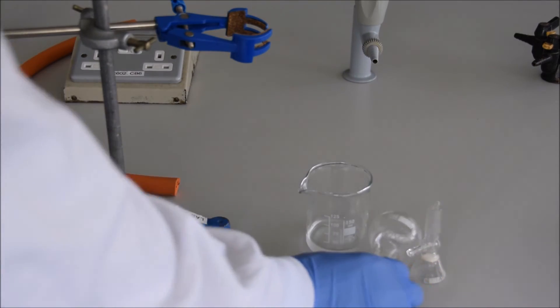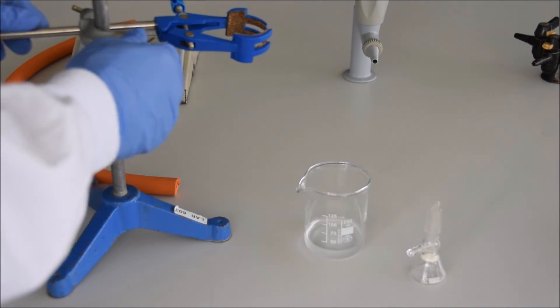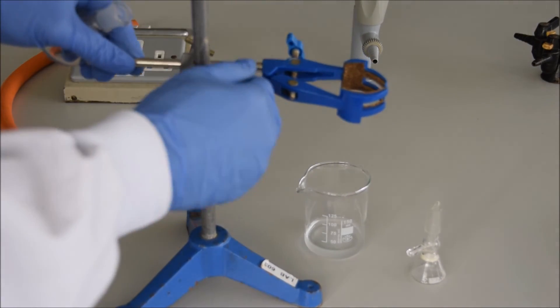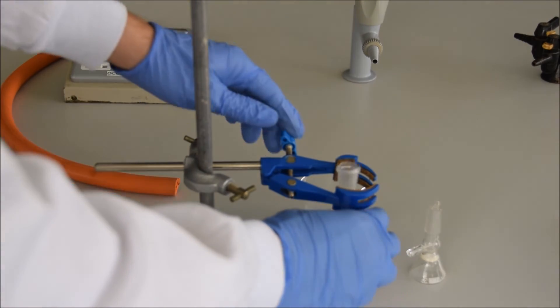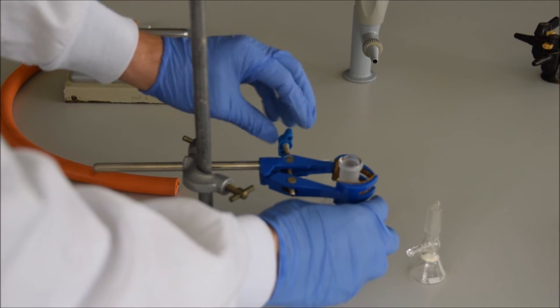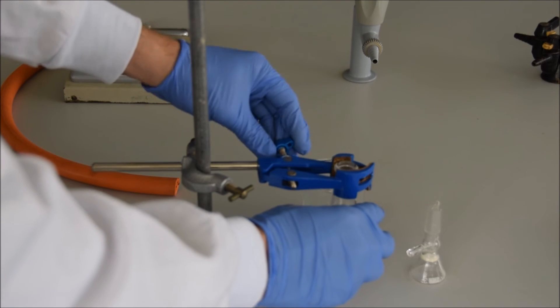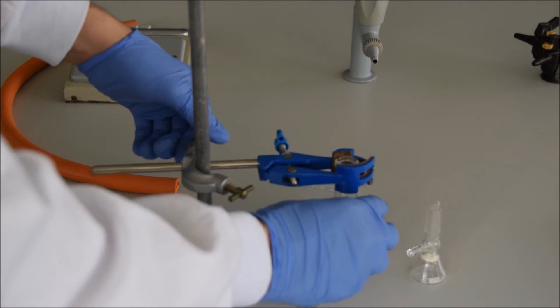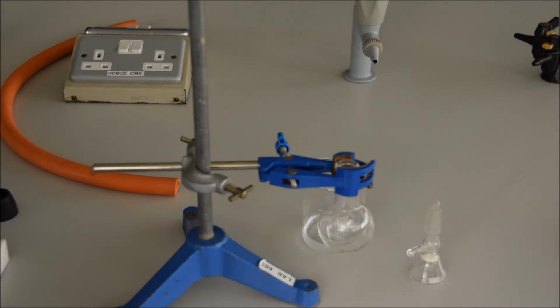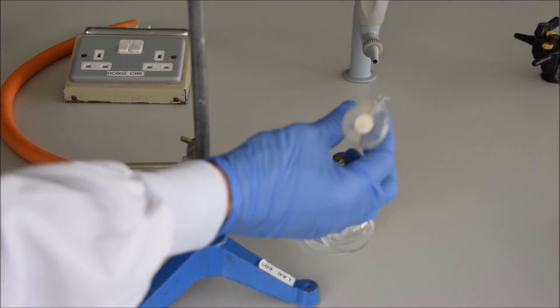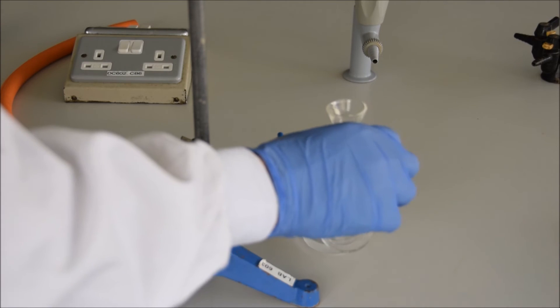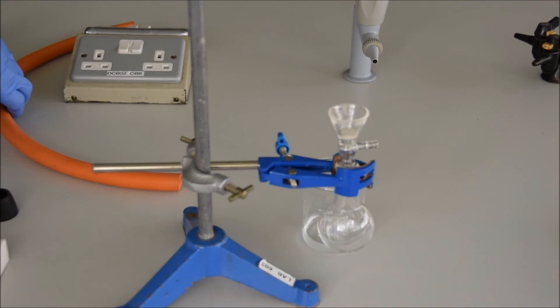Okay, let's look at the last kind of funnel then—a fritted funnel. Here we have a particularly nice fritted funnel because it has a sidearm built into it. The first thing to know about fritted funnels is that they're much more expensive than either Buchner or plain funnels. You don't need to use a filter paper in them and they're much better at filtering out fine powders, but they're also permanent so you can't clean them as easily as taking away a piece of filter paper.